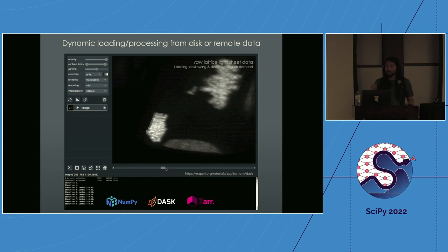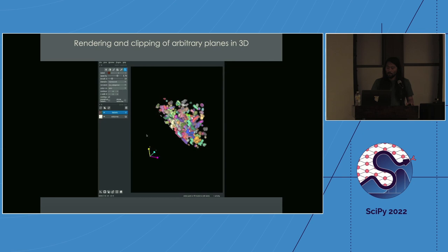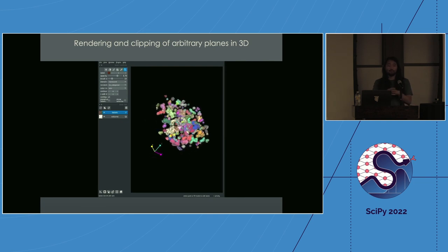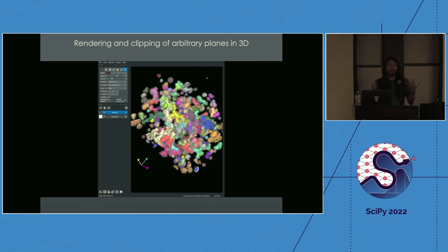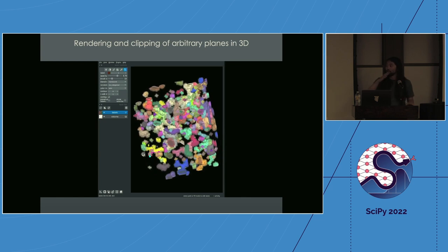We also allow three-dimensional rendering that lets you selectively render planes. For example, if you have a 3D dataset but want to see what's in the middle, this lets you slice through or cut away different parts of the image and just see the parts you're interested in.